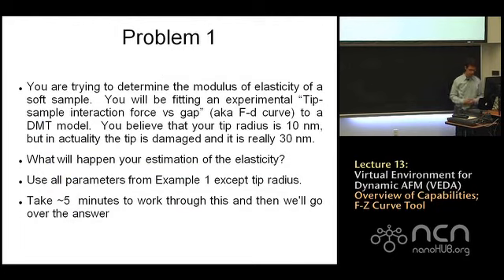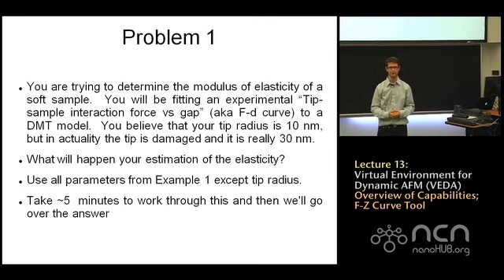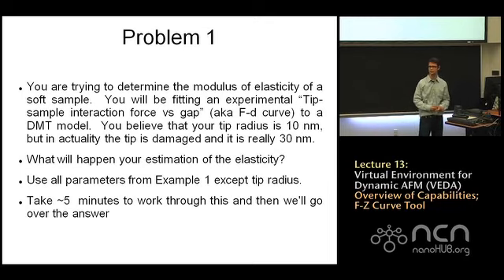Okay, so with that, I'd like to get into some problems. The idea is we're going to give you a scenario that we're trying to understand using the simulation tool. We'll give you a problem description, I'll let you have at doing a simulation to find the answer, and then I'll go over the solution that I came up with.